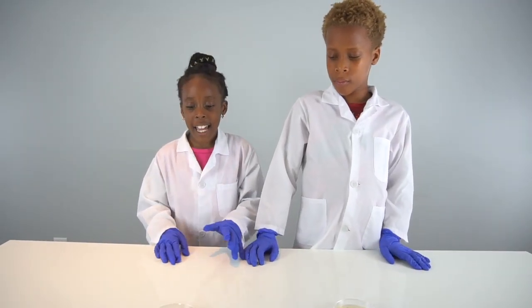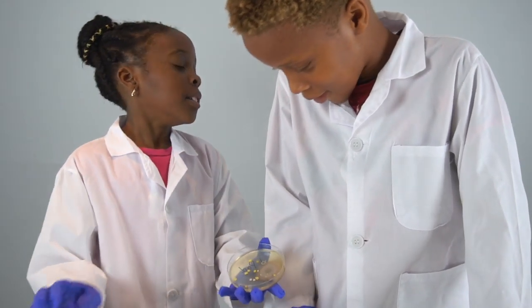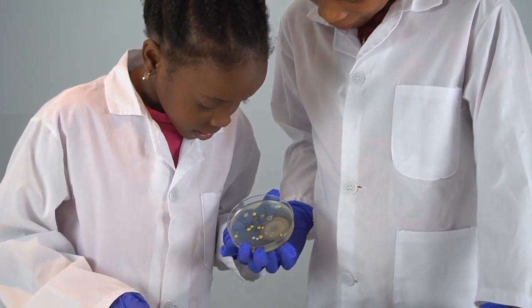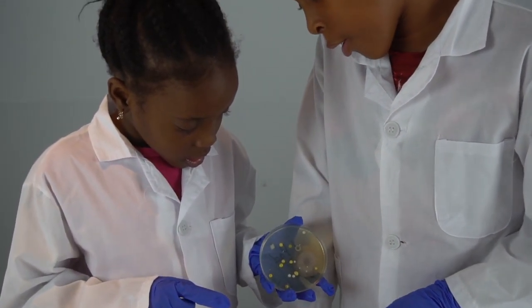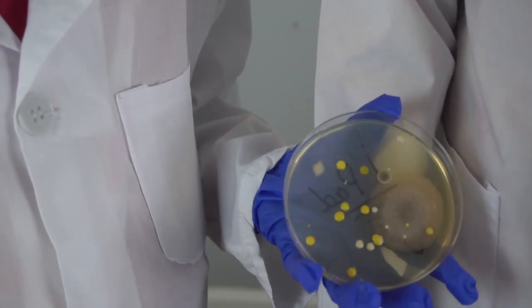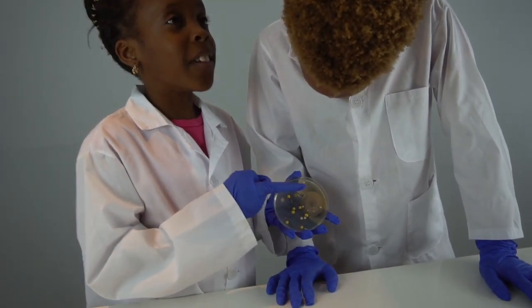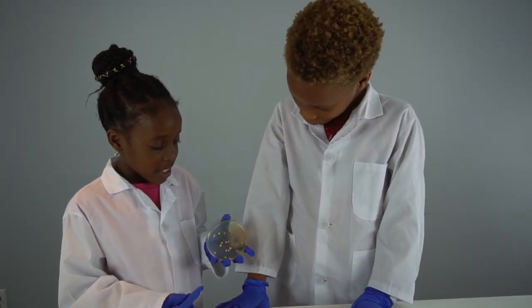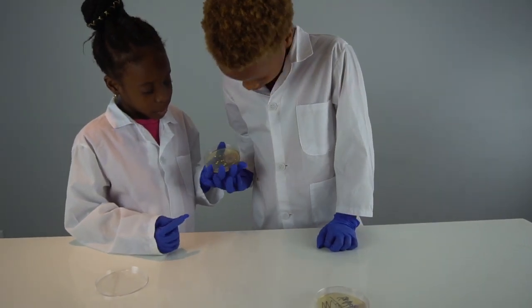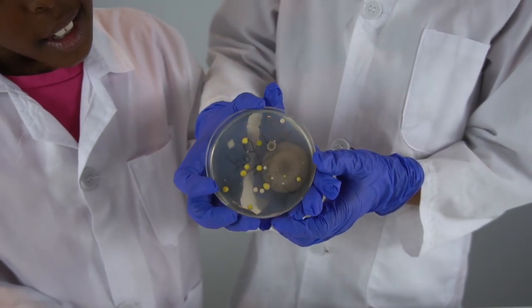We left the bacteria grow for seven days and these are the results. Now we're going to see how dirty my iPad case is. This is really dirty — look at it! I really thought it was going to be way more dirty than this. Make sure you don't touch the bacteria because you might get sick. It looks weird, it looks like a blob. Wow, that was so dirty.